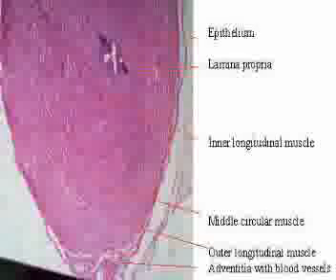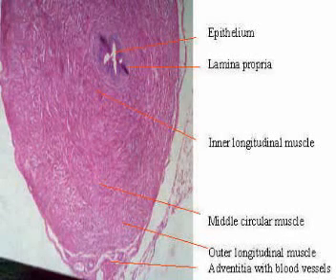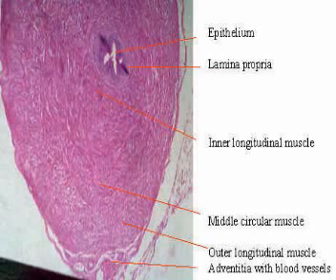Vas can be confused with other small luminal organs like appendix, ureter, bronchi, or fallopian tube. Nevertheless, it is still considerably smaller and more muscular than all the above.